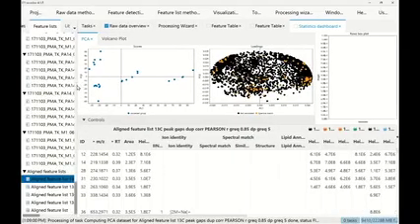And for a long time, we said, okay, statistics is not our focus because there's other toolkits like Python and R and so on that are much more versatile. But then again, it's not connected to everything else. So here we really try to focus on all the standard methods. If you're missing something, please ping us so that we know, and we can develop it, or maybe we can develop it together, right? And bring it in here.